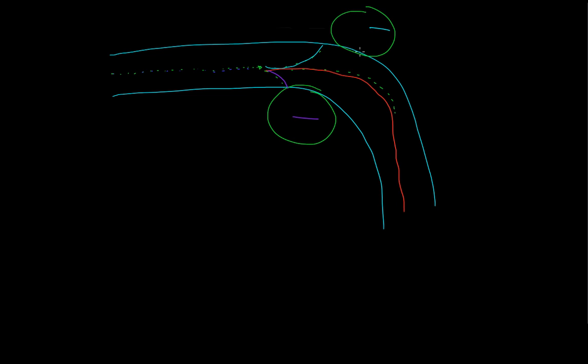So whilst this may produce a charge too negative and that our green molecule will hit the side, the other one might find that just enough, our purple molecules might find it enough to go straight into the hole. And then we'd need to change that, and the beam would end up so that the purple molecules go in here and the green ones go in here. So by altering these magnets, we can effectively aim our separate beams of ions that would result from them having separate mass into different directions.